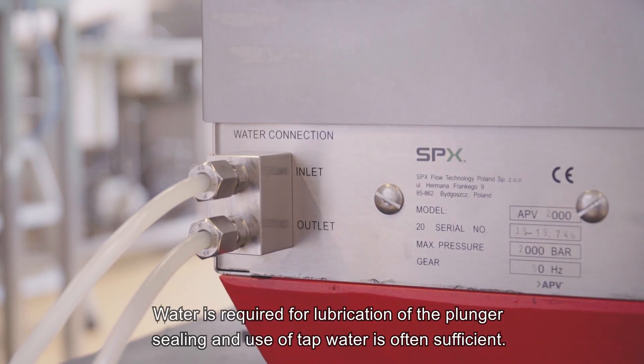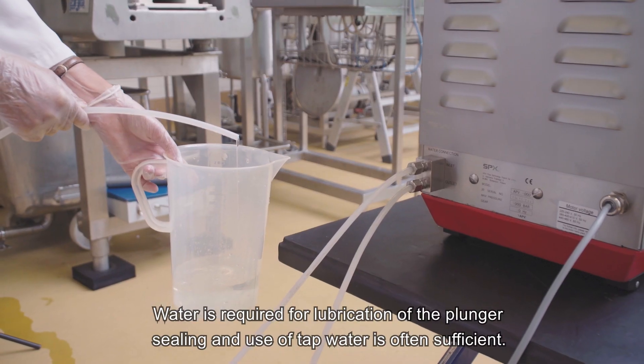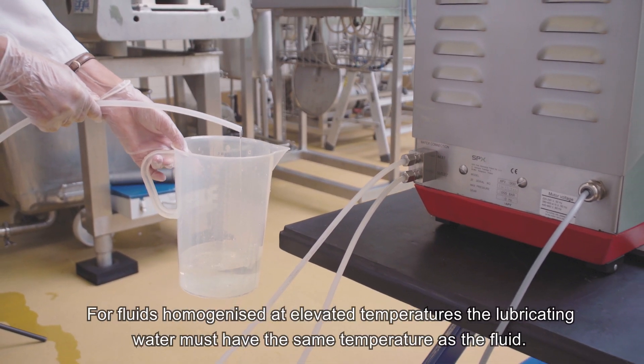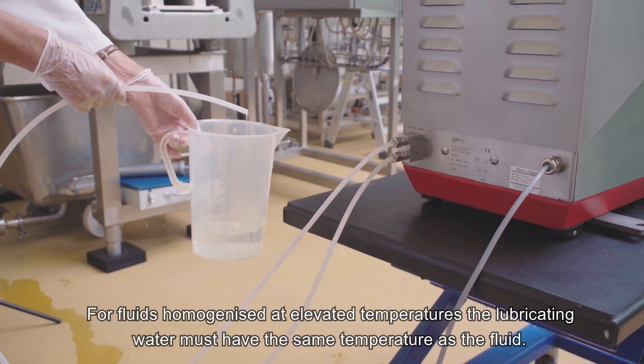Water is required for lubrication of the plunger sealing and use of tap water is often sufficient. For fluids homogenized at elevated temperatures, the lubricating water must have the same temperature as the fluid.